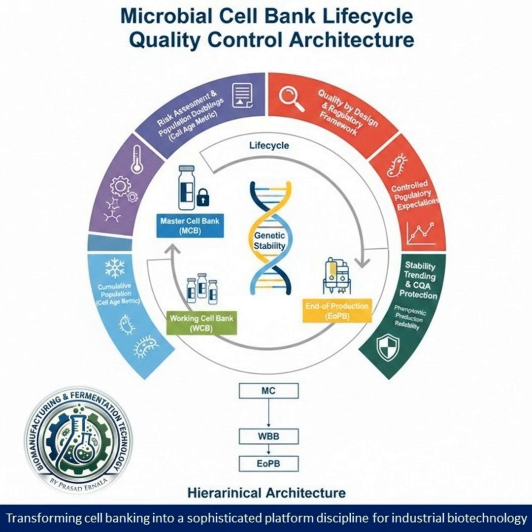That detail is critical. And speaking of pristine versions, it seems the cryoprotection strategy is also highly customized. Treating all microbes as one big class is a mistake. It's a huge mistake. The constraints are completely different. Your choice of cryoprotectant, your cooling protocol, it has to be dependent on the organism structure and even where the product is inside the cell. So let's take E. coli, the classic workhorse. What's their main vulnerability when you freeze them?